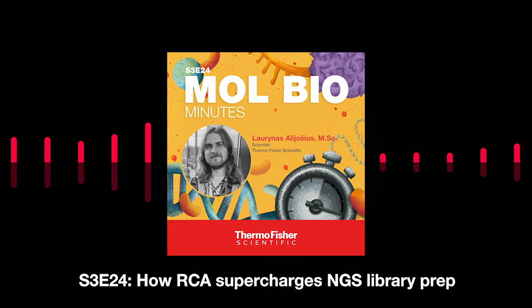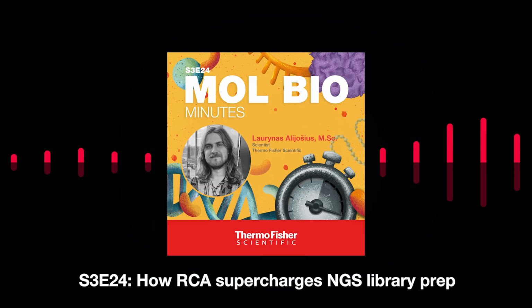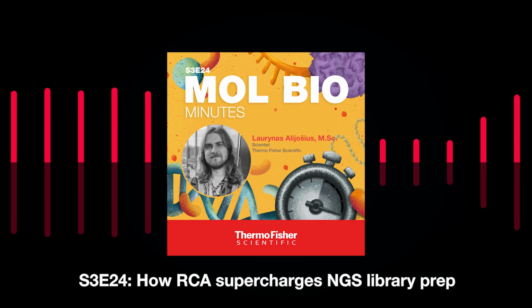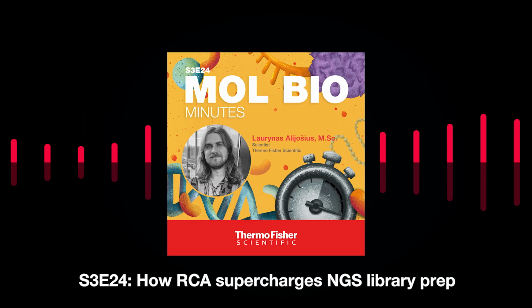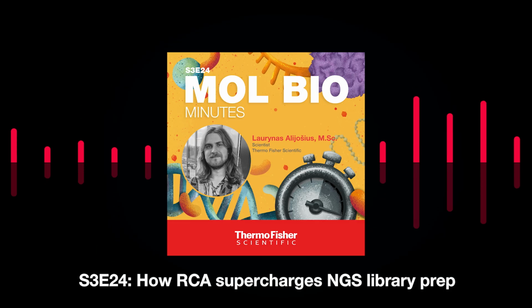But luckily, one of my colleagues knew how to solve this problem. He knew just the right method to amplify very low amounts of circular DNA. And that method is rolling circle amplification. So, what kind of method is the rolling circle amplification? Or we can just call it shortly as RCA.